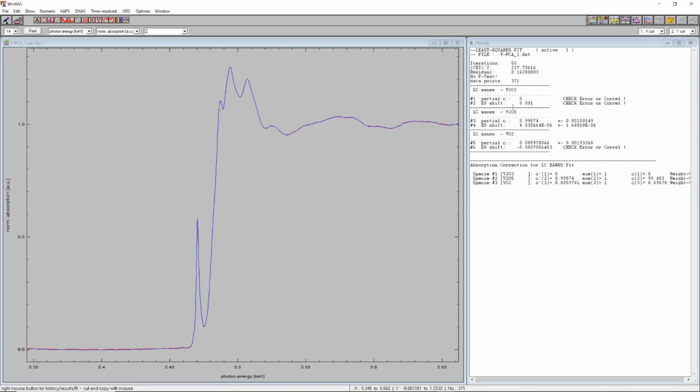So there's a concentration and there's the E0 shift, and apparently we start with V2O5, rather pure vanadium pentoxide, in this reduction of vanadium pentoxide to V2O3. So we basically have a concentration of 1 in V2O5 in this case.